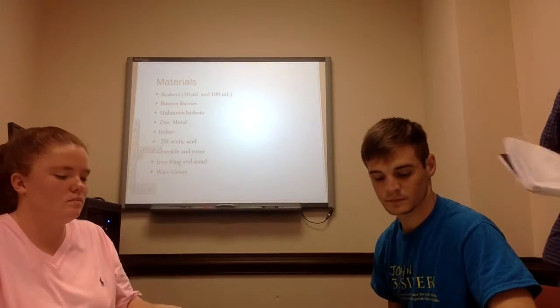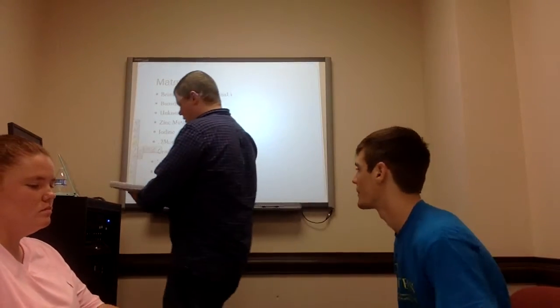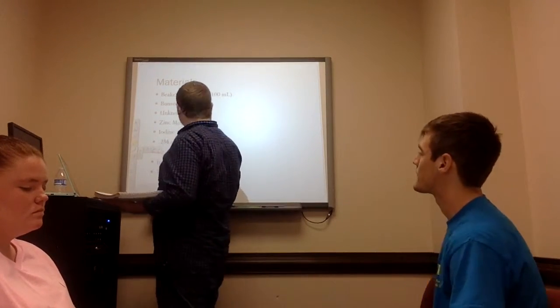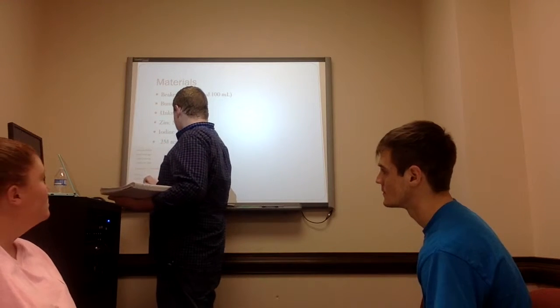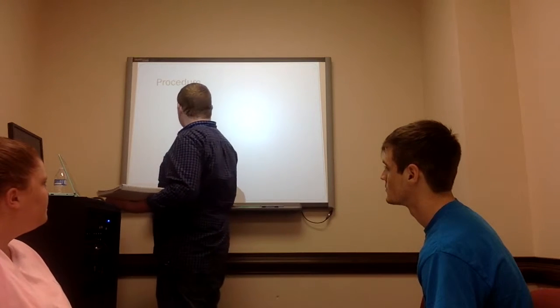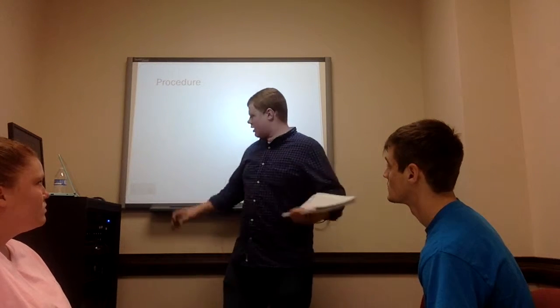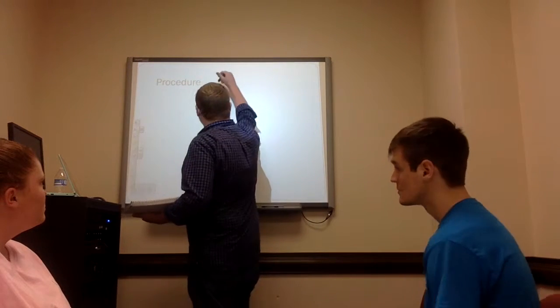And everywhere that there are calculations, I may jump in. So we'll get started today with the procedure, and we'll start with RNA.